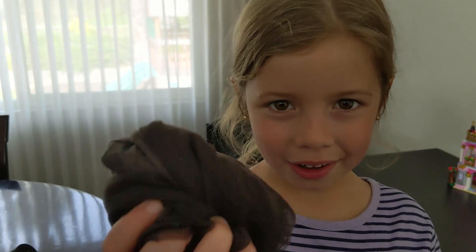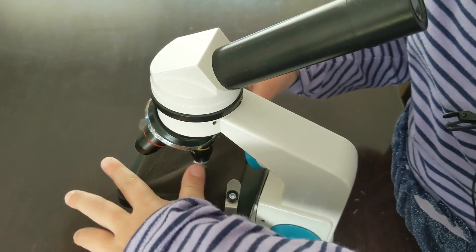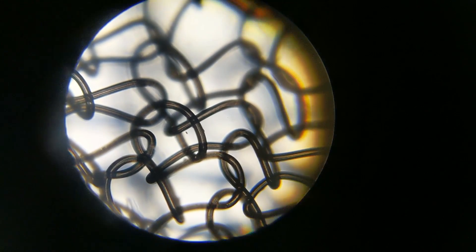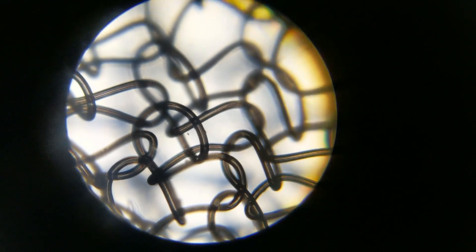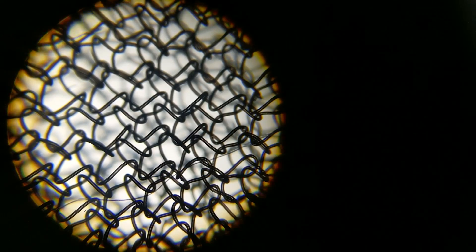Let's look at Mommy's pantyhose. Oh, wow. It looks like finger knitting. Imagine making that by hand. Let's look at it under a different power. Now it looks like a chain link fence.